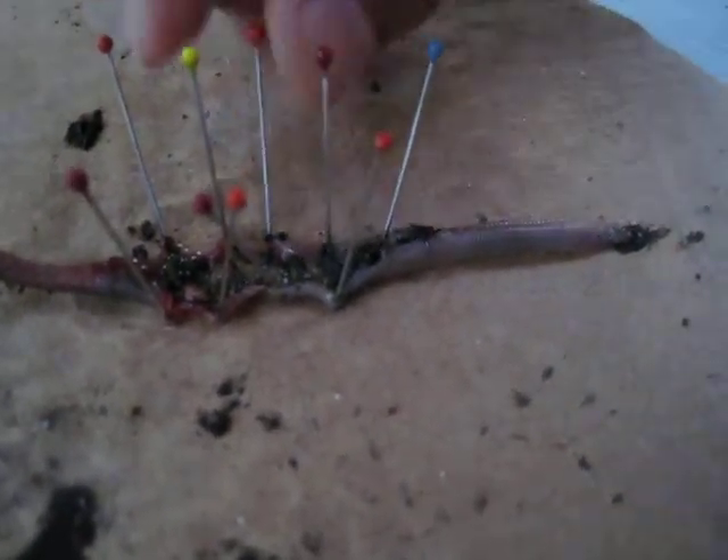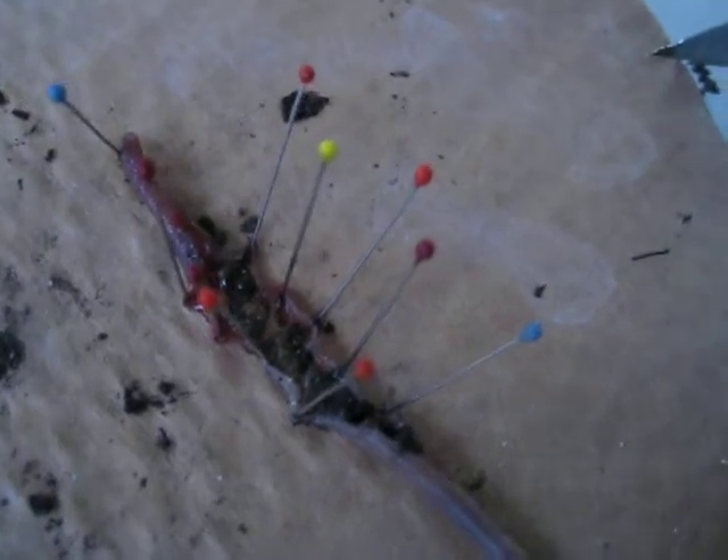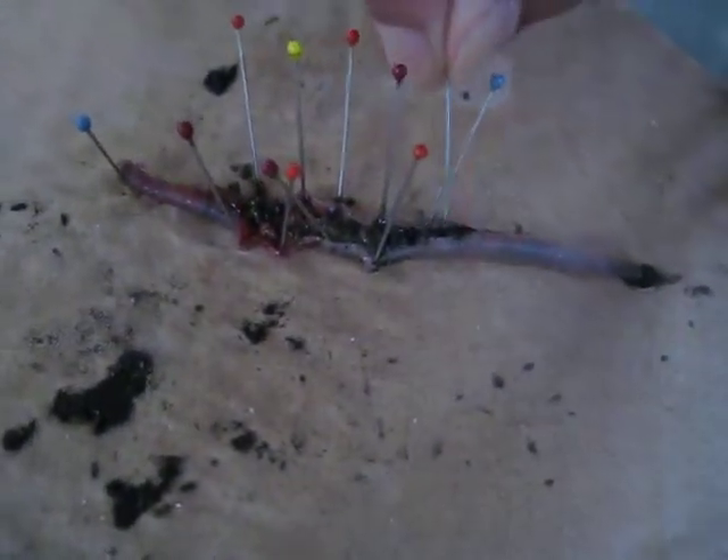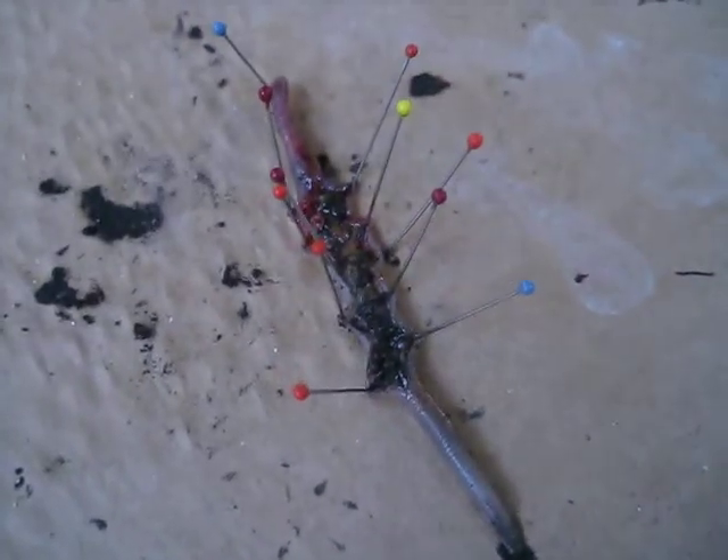Anyways, I think that's all. That's our final dissection. One more pin. So, yeah! That's... ta-da! Not very... lovely. Put the camera on us so we can wave so they know we're not... Hi! Hi!